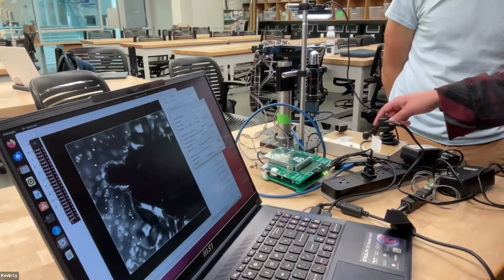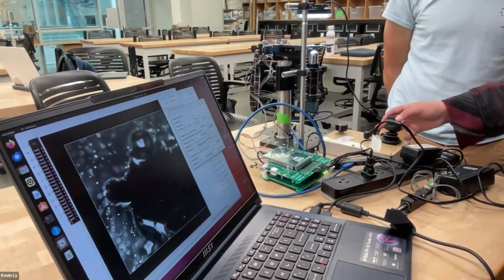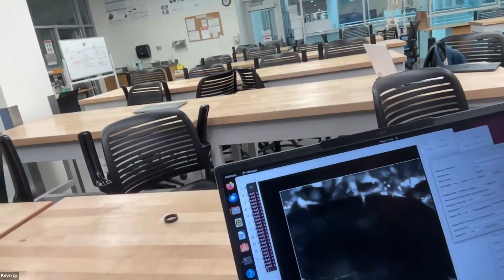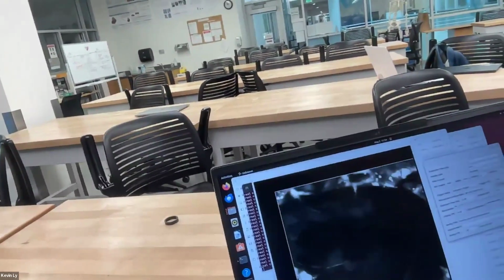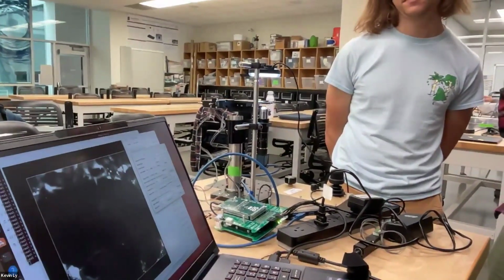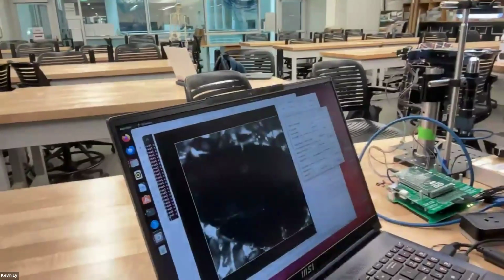Not given willingly. Any insect people? Can we tell if it's male or female? My assumption is that with most of the... Oh, is that the limit already? Females are the ones that go for blood. I bet the males, yeah, probably. Super teeny on its side. Legs.